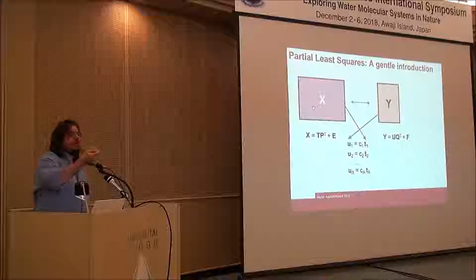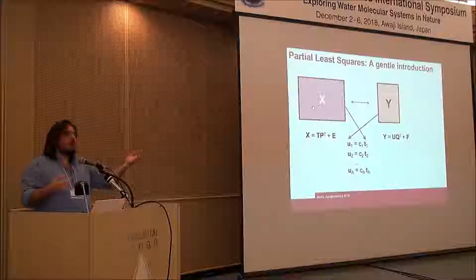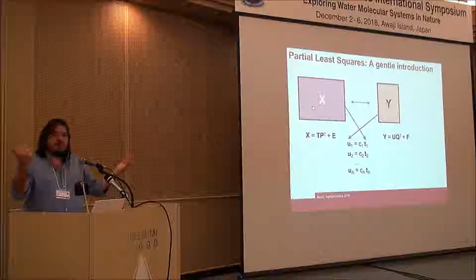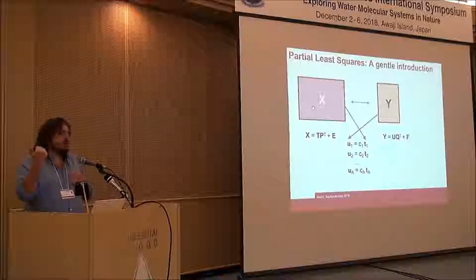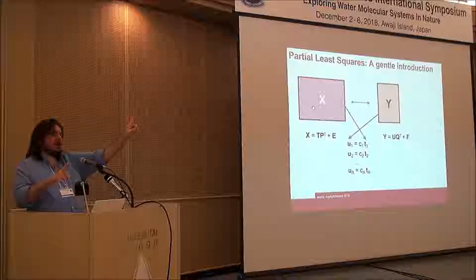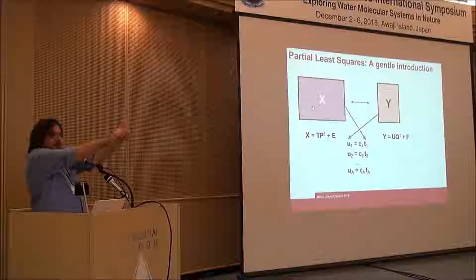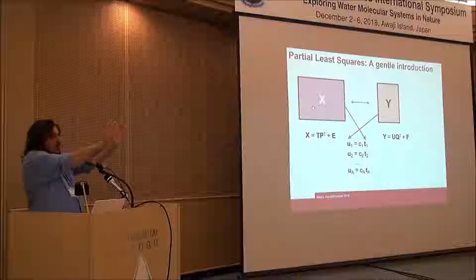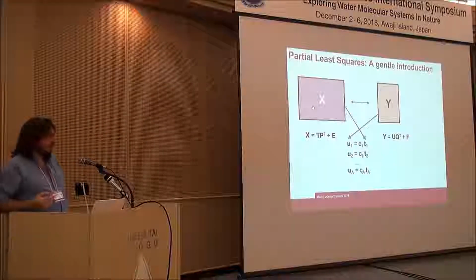But then I want something more. I want my X block to be predictive with respect to Y, to describe the variance in Y, not only the variance in X. So if this is the direction of my first X score, and this is the direction of my Y score, then what I would try is a slight tilting and move one in the direction of the other.